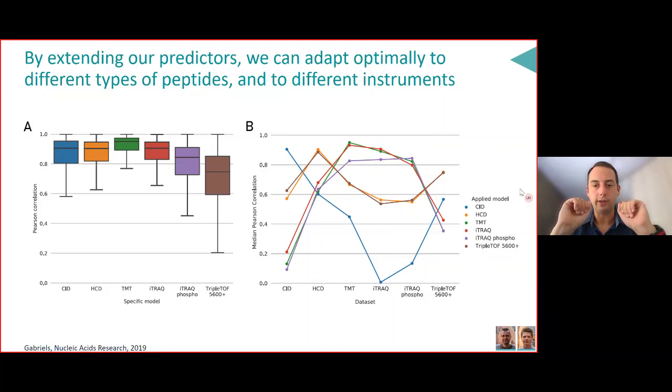I think we've reached a level of sophistication with MS2 predictions that are probably on a diminishing returns curve. So we can make the algorithms 10% better, which is going to be very difficult and take a lot of time, but it's only going to make, say, 0.5 or 0.3% difference in the final results. So I would imagine that any algorithm that is being built today that is somewhat competitive with what is out there will have very similar results.